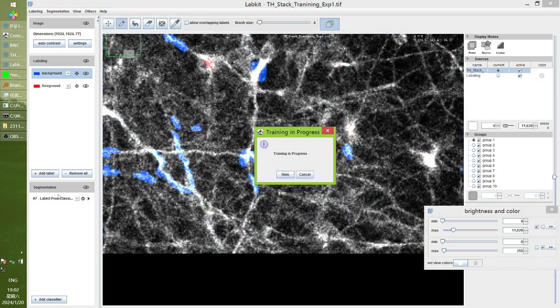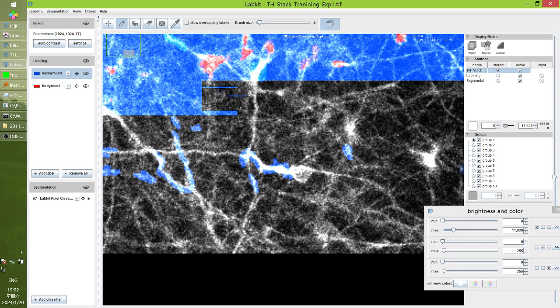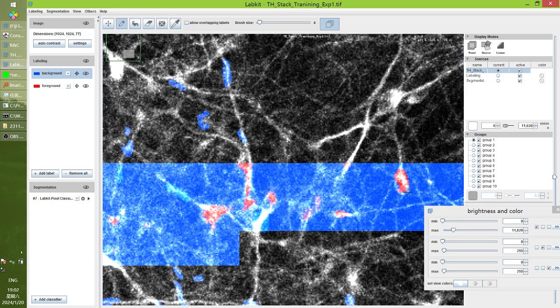So for these complicated images and huge Z stacks to train, it's better to perform it on a computer with a GPU, because my laptop has no GPU, so every time is so tedious. Every step is so tedious. But here I'm going to show only a demo. So the real process will be much longer.